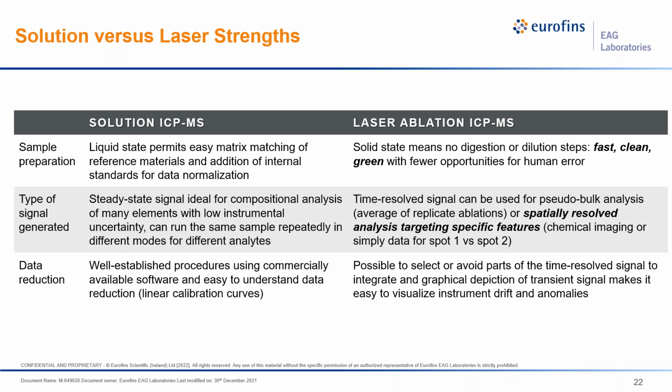Now, laser ablation is both more powerful and a bit more finicky and requires more expertise to do well because you're looking at a time-resolved signal. So you can really burrow down into the nuance and details of what's happening if you have the skills to really visualize those data and see what's going on. So it's possible to select or to avoid parts of the time-resolved signal before you integrate it to get your concentration. And that graphical depiction of transient signal makes it easy to visualize instrumental drift and other anomalies. So an expert analyst can really see what's going on and whether they're getting consistent results over the course of a long analysis run.